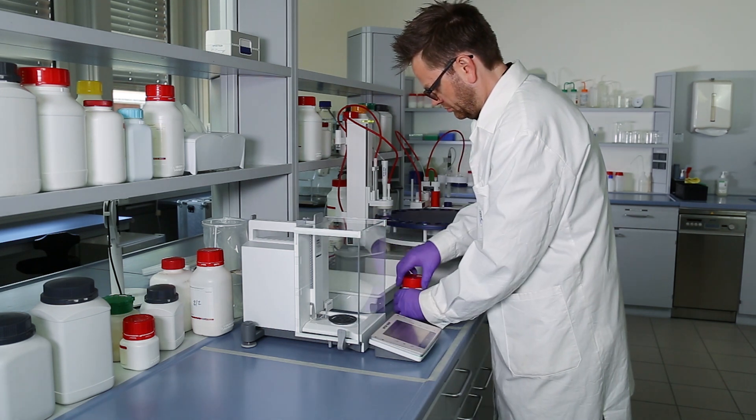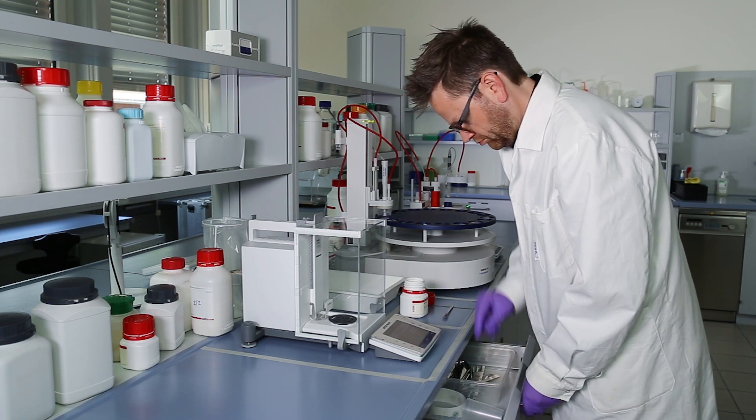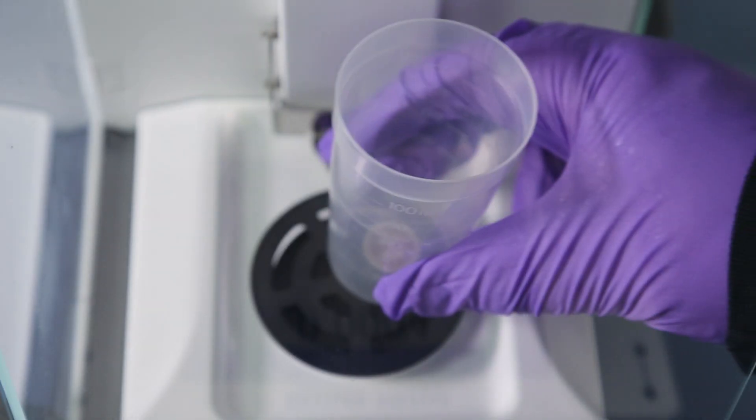Now the technician is working differently. His workspace is optimized for efficiency according to one-piece flow. Recent Mettler Toledo innovations such as RFID smart tags are ideally suited to the principles of one-piece flow.